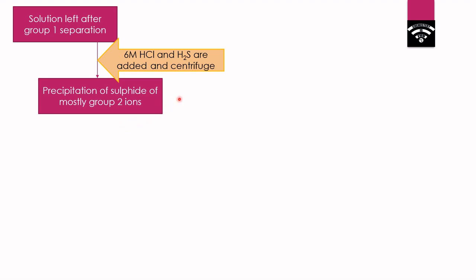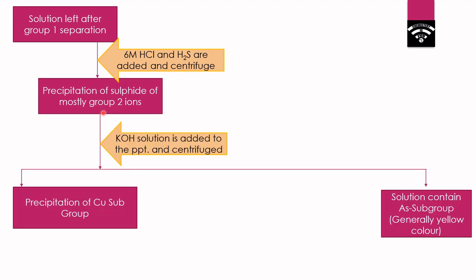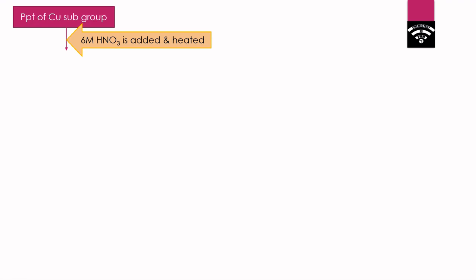We separate the precipitate by centrifugation and add KOH solution to it, then centrifuge again. Copper subgroup sulfides cannot dissolve in KOH and remain as precipitate, while arsenic subgroup sulfides dissolve into the KOH solution. By centrifuging, we separate the two groups into different test tubes. For the copper subgroup precipitate, we add 6 molar HNO3 and heat it, since copper subgroup sulfides dissolve in 6 molar HNO3.